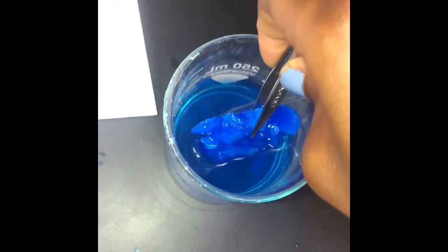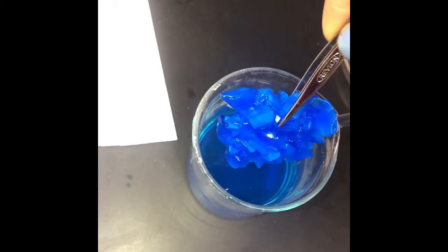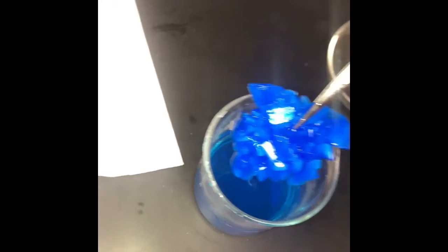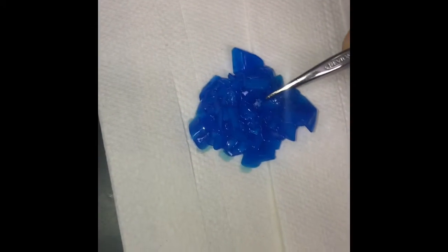As the solution cools down, copper and sulfate ions will begin to attach back again, forming orderly crystals. After a day or two, a layer of seed crystals should have formed at the bottom of the solution. Using tweezers, remove that layer and place it on a clean, dry towel. If the crystals are attached like mine, you can use your choice of tools to gently tap and break the crystals apart.